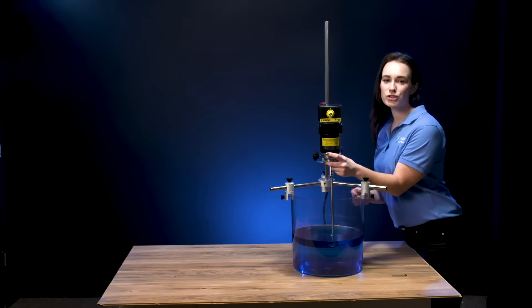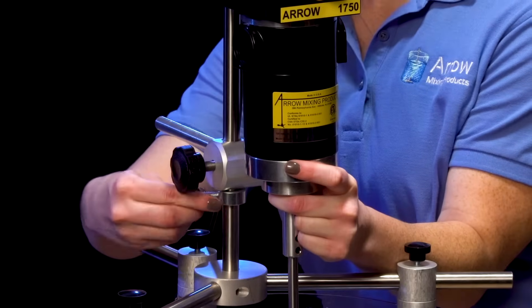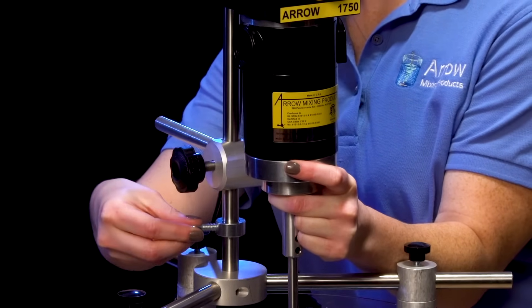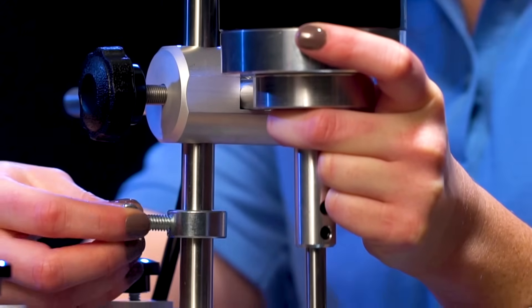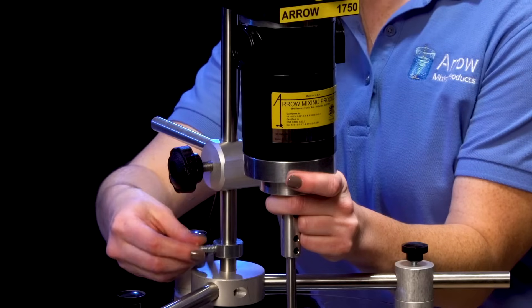To adjust the height, hold the stirrer for support. Unlock the collar. Slide down the center rod until you reach your desired location. Re-lock the collar.